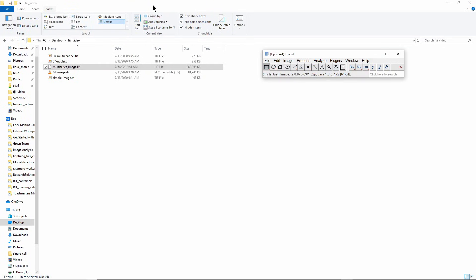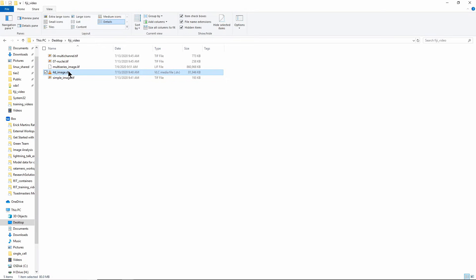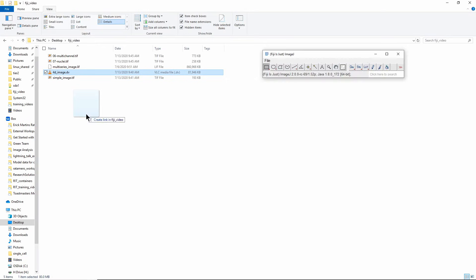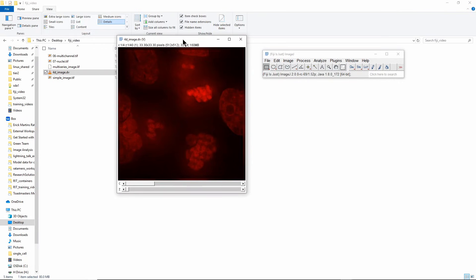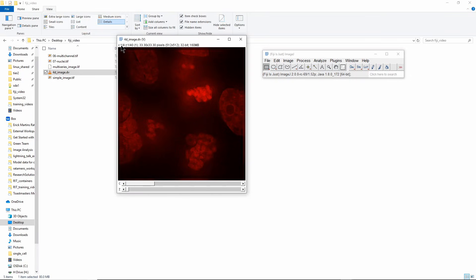Now I'm going to show you how to navigate different dimensions in Fiji. First thing I'm going to do is open this 4D image. It's also a DV image. In this case because it's a relatively simple one you can just drag and drop and it will do a pretty good job. You can see that this is an image that shows it has four channels, so it's showing channel one of four and z slice one of 40.